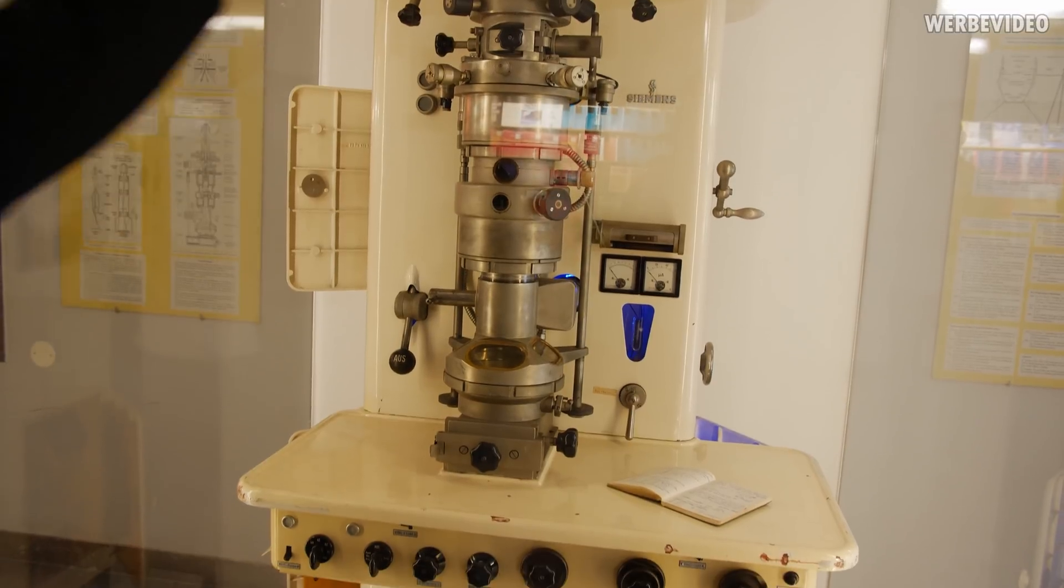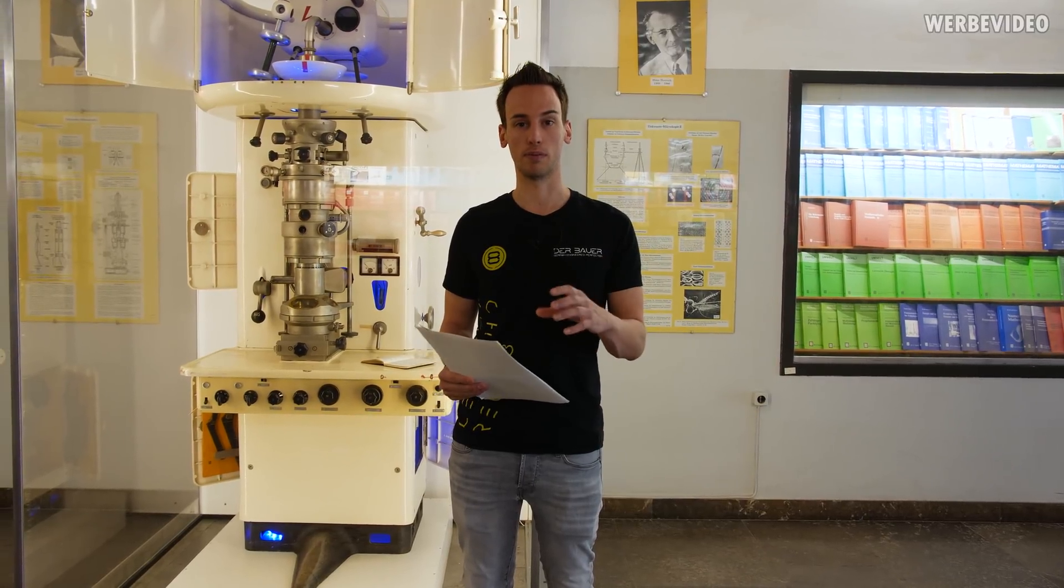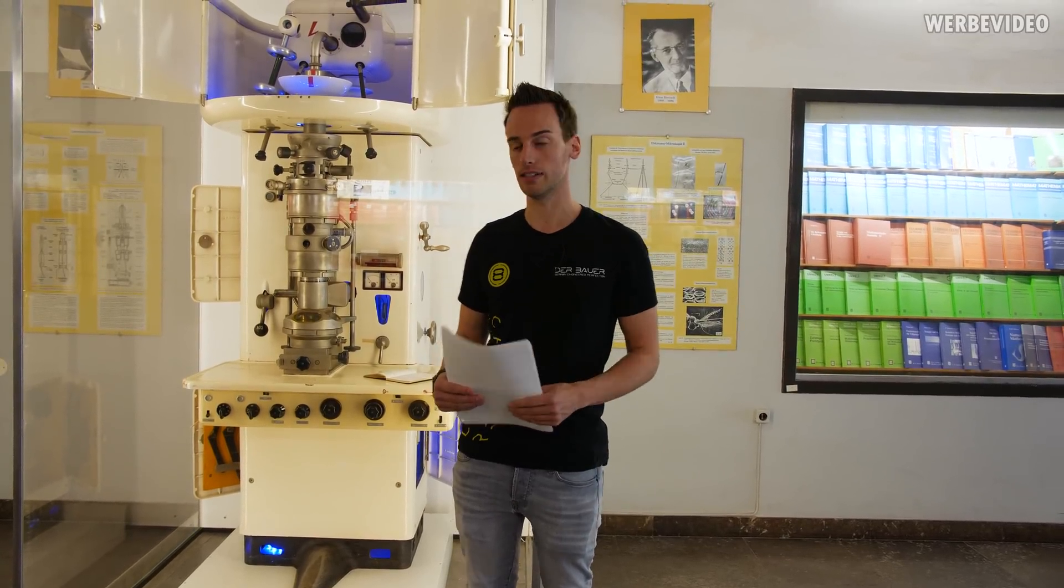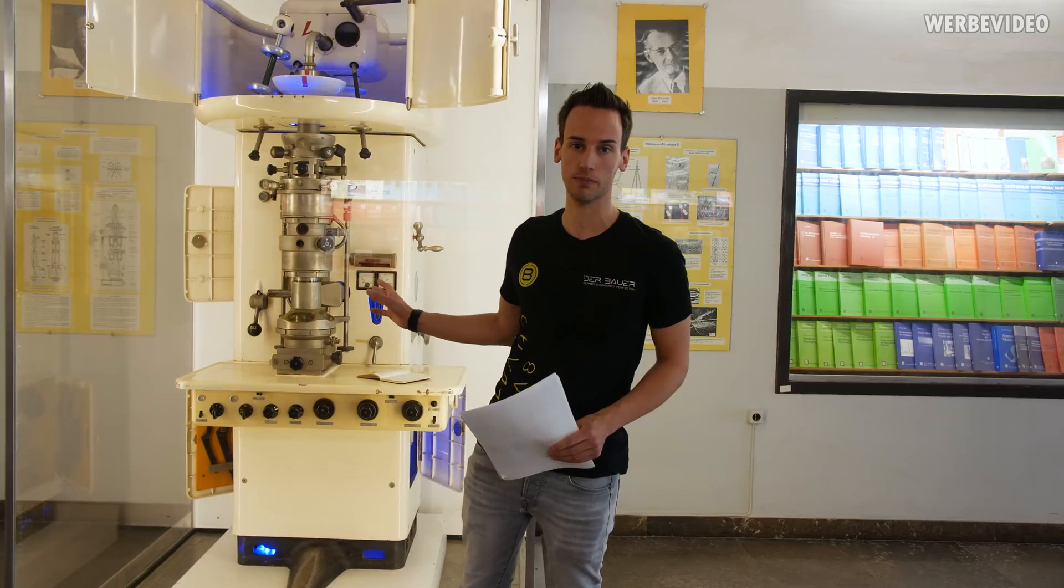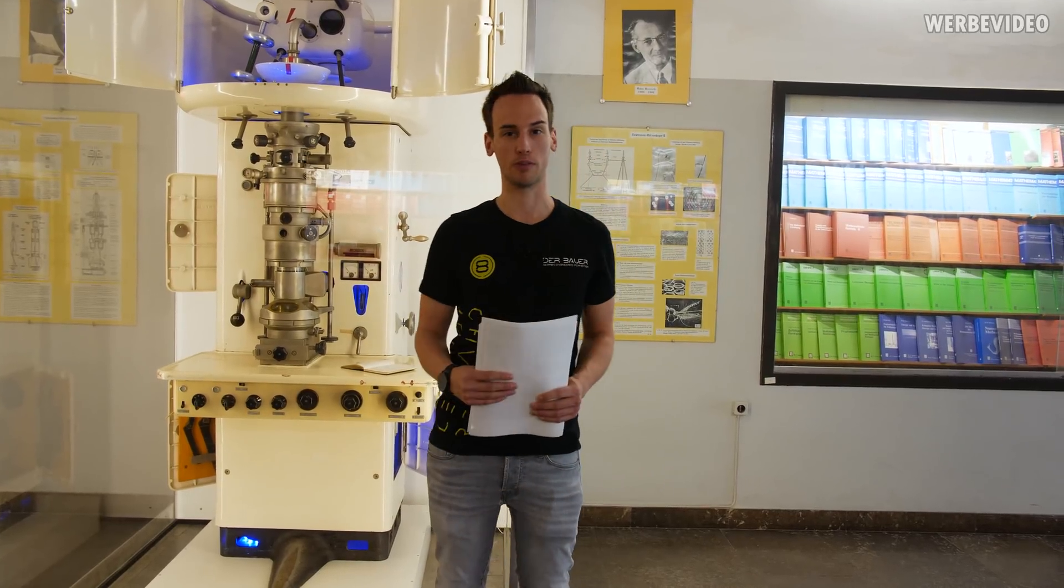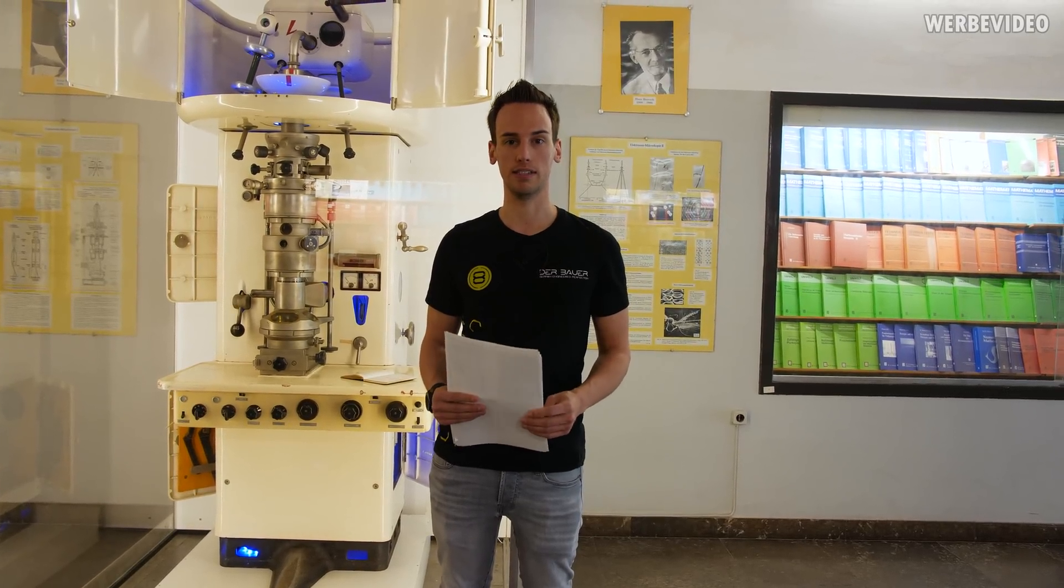Originally the TEM was founded by Ernst Ruska in 1931 and by 1933 they already managed to bypass the performance of a normal microscope. By 1940 they already had a higher resolution than 13 nanometers and this one is from 1946. Obviously you can guess that performance-wise we would not be able to focus that deep down on the 9900K. That's what we will do today with a modern TEM.